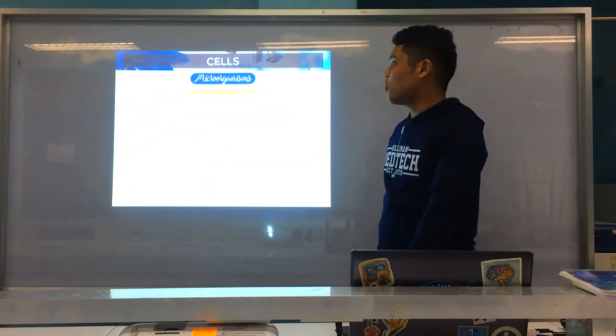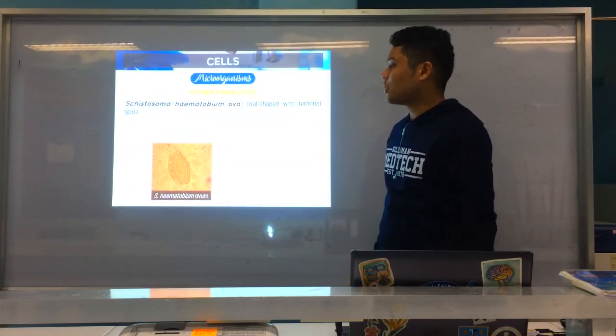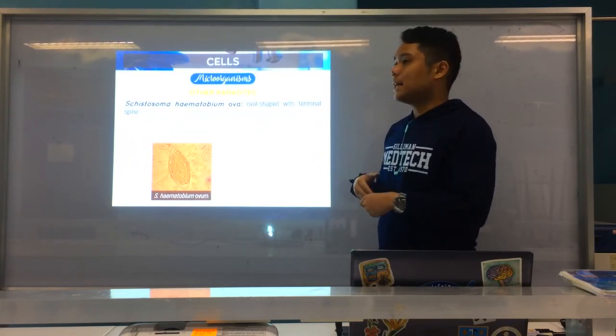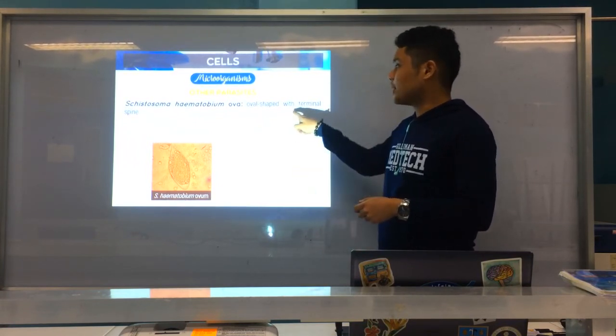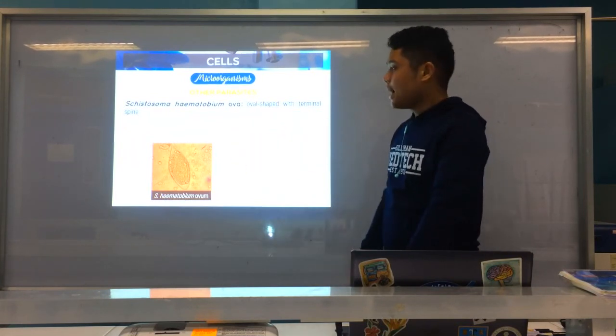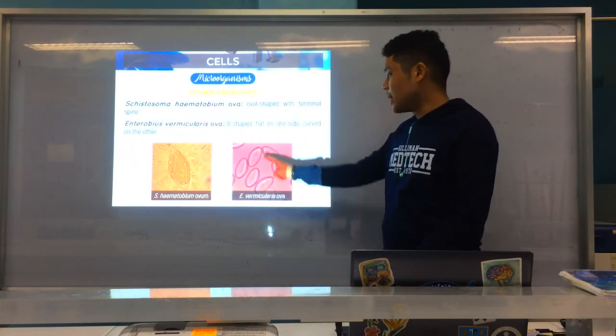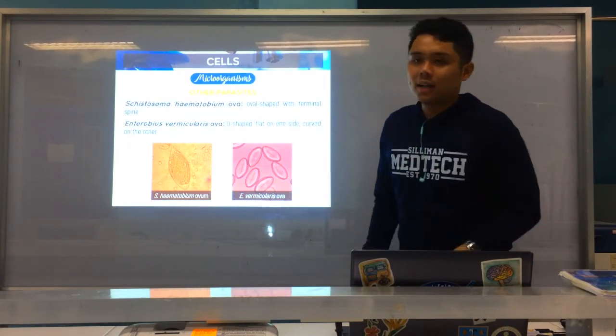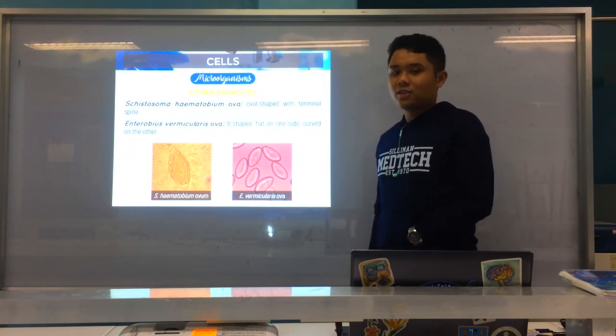And last, you have your other parasites. Schistosoma hematobium. Again, your, of course, bladder fluke. Terminal prominent spine. Terminal prominent spine. And you have Enterobius vermicularis. D-shaped again. Ova, usually a sign of contamination from feces. Okay? Alright.